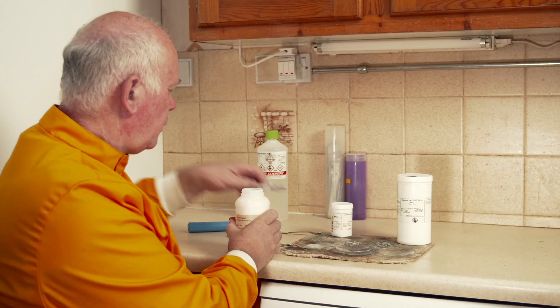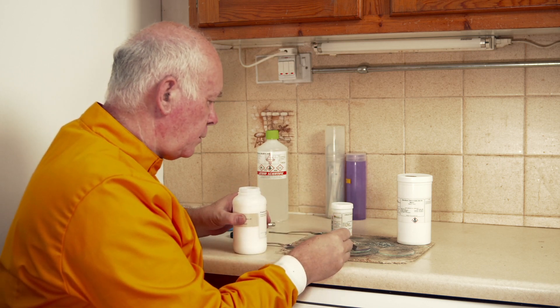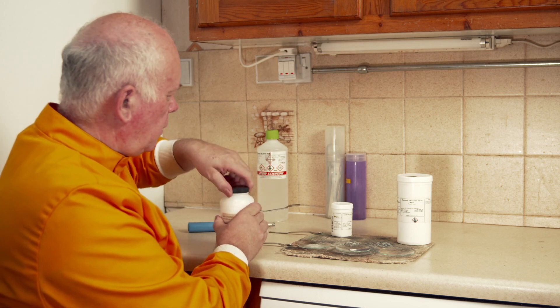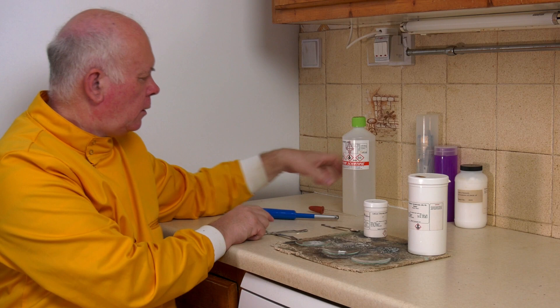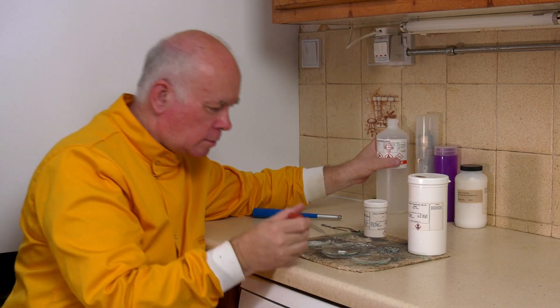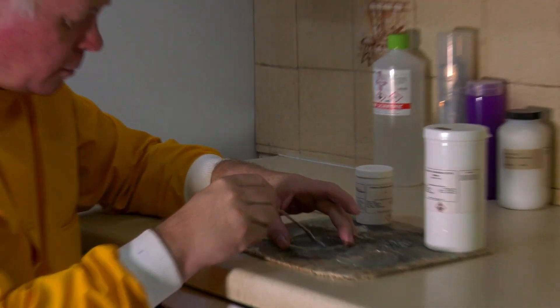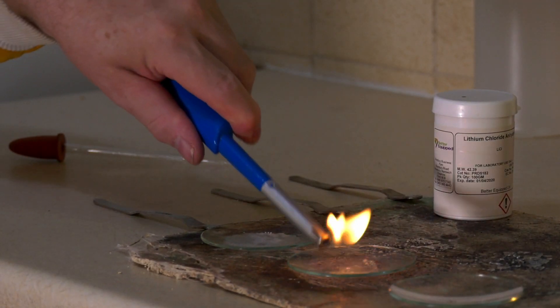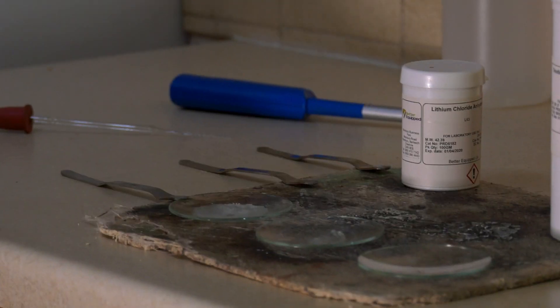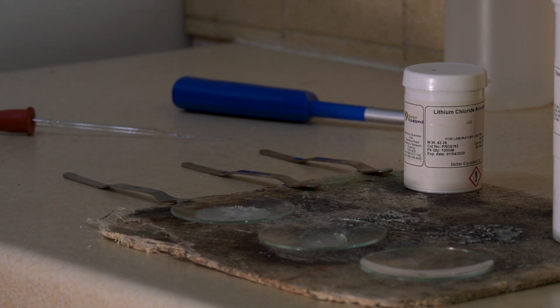Now I'm going to do the same thing, but this time with some potassium chloride. This burns with a lilac flame, which is quite hard to see. So when we get this one going again, we're going to dim the lights so that you can see it. Let's mix it round and light it to see what happens — there's the lilac flame.